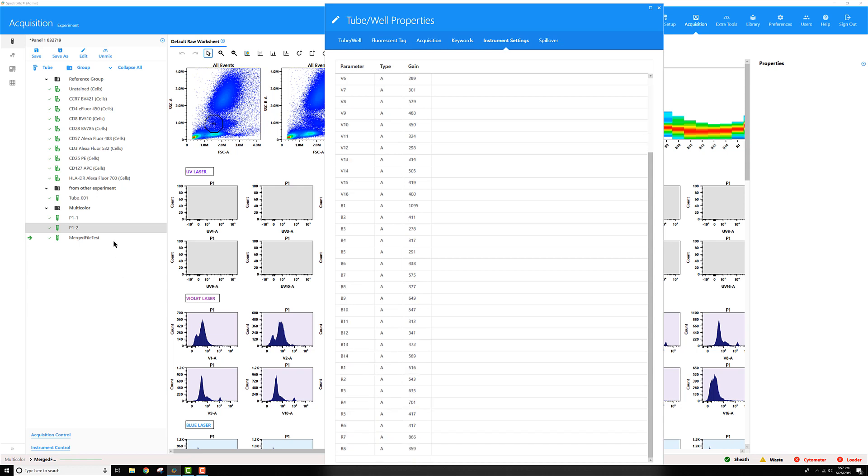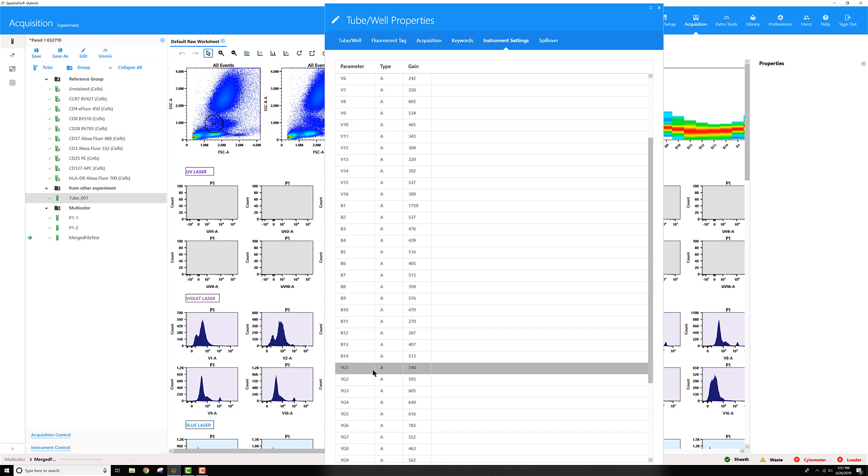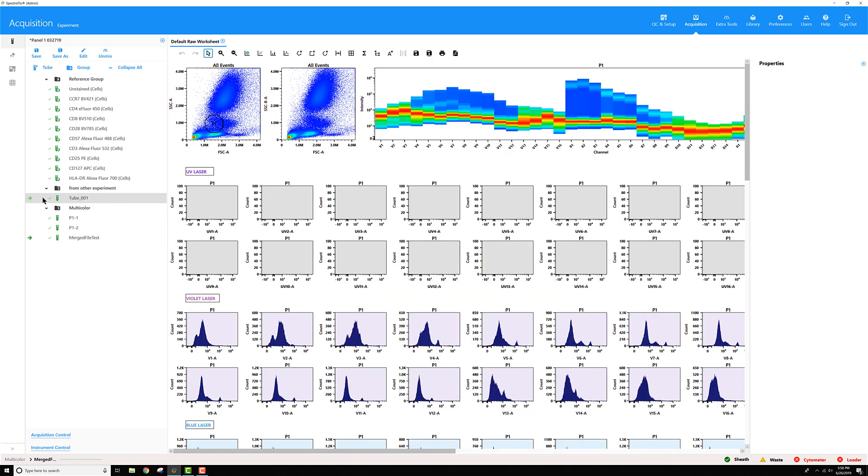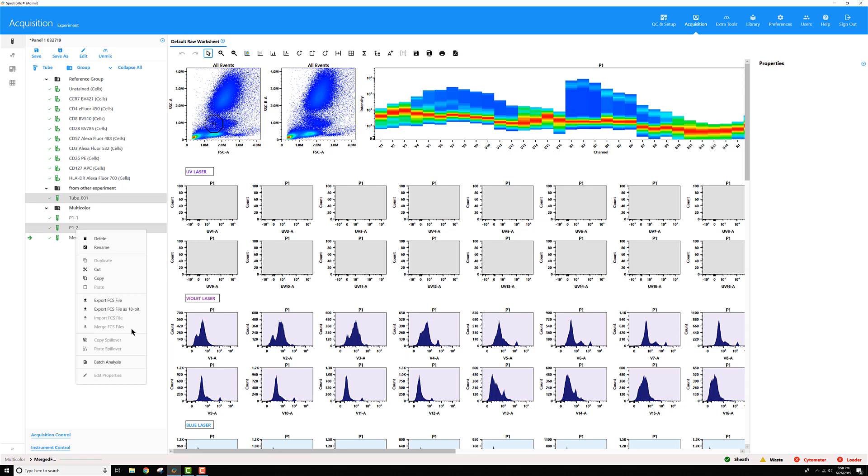However, if I look at this other tube that I imported from a different experiment that was run on a completely different system, you can see this one has an entirely different laser that the previous file didn't have. So if I wanted to merge together this tube 001 with my other P1 tube, I could try to select them. But when I right-click, the merge FCS files menu is disabled because they don't have the same parameters.